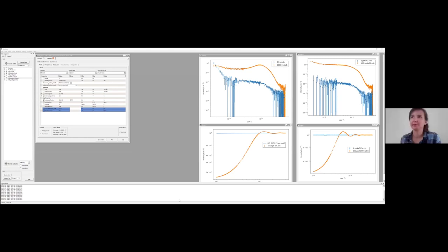I have a question. Maybe someone already asked this, but can we copy feeds from previous sample to a new sample, or we have to set up each time all these parameters? You do have to set up each time. So if you've done it before and you saved your project, it'll populate the fits that you've done before. But when you're moving from one sample to the other, yeah, you do have to type them in, I believe. I don't think you can.